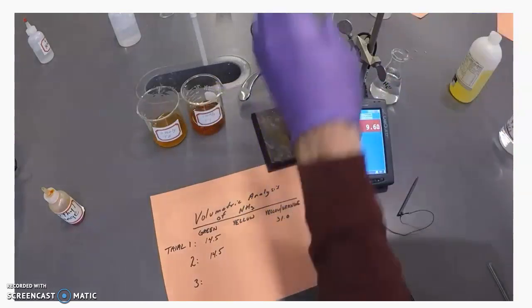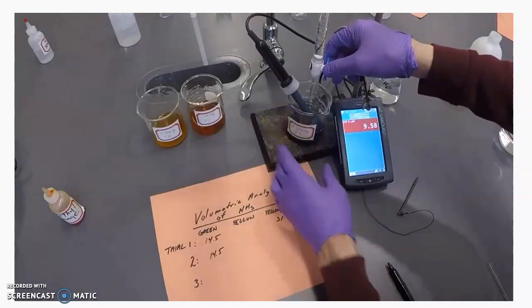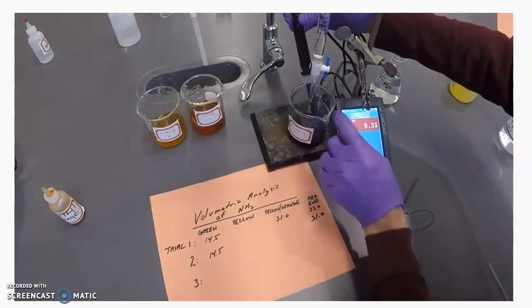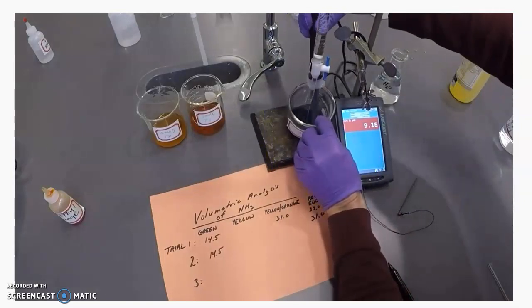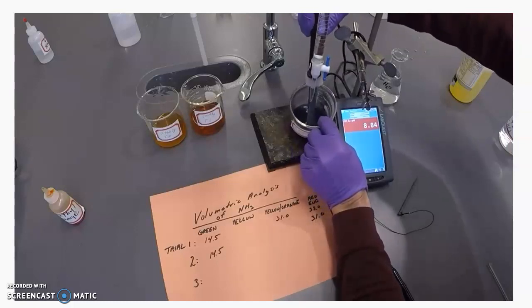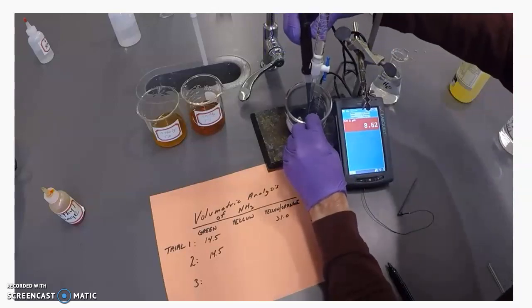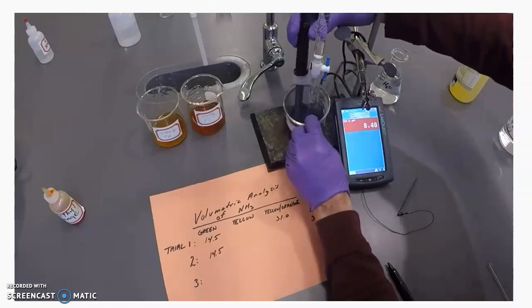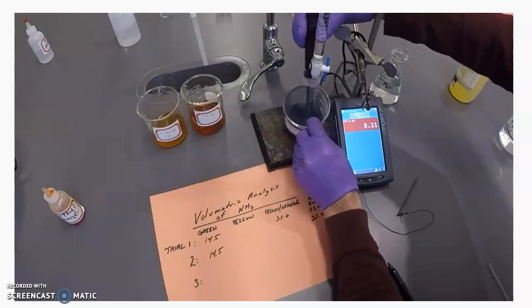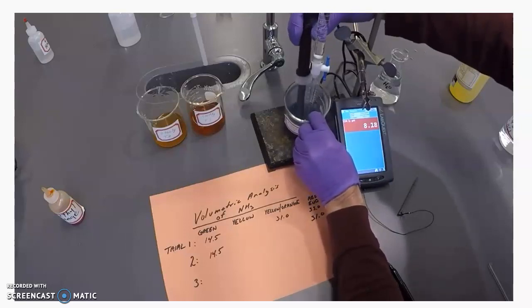So right there, he's just set the burette to an initial volume that he's read, and now he's starting to add the hydrochloric acid and just stirring with that pH meter. So you can see the color is very, very dark blue there when we start, almost purple. You can disregard the data that he has written on the piece of paper. The data that I just showed you is the data that you'll be using. He's got a couple different things going there, so I'll show you that at the end as well.